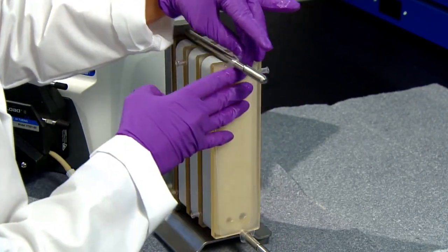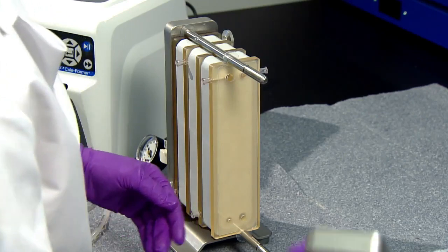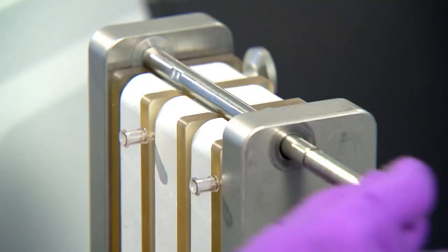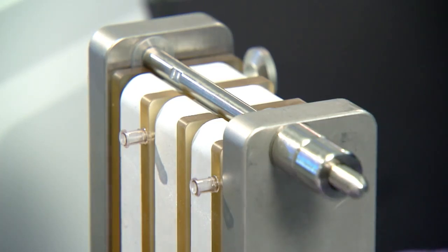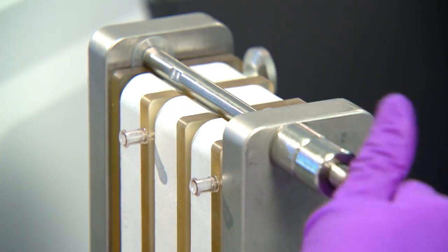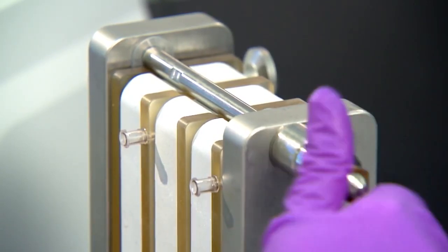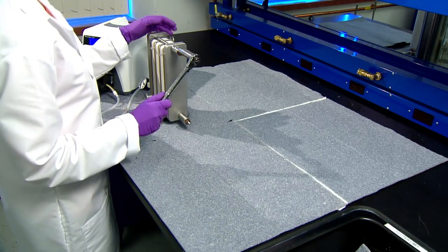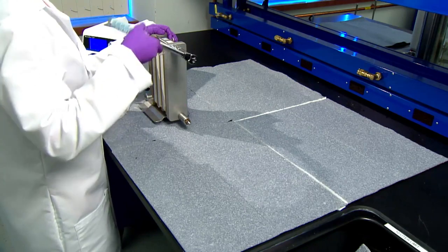A final gasket and end plate will cap off your assembly. With your assembly installed in the holder, simply place the washers, spacers, and nuts on each tie rod. To secure in place for proper performance, torque each nut to the standard Pelican mini holder setting.